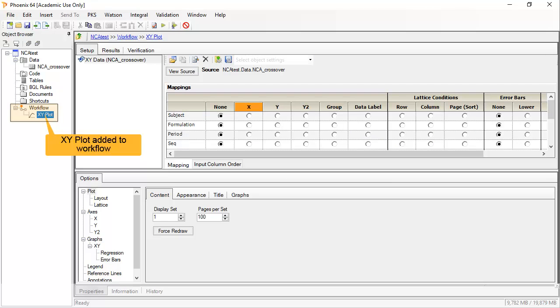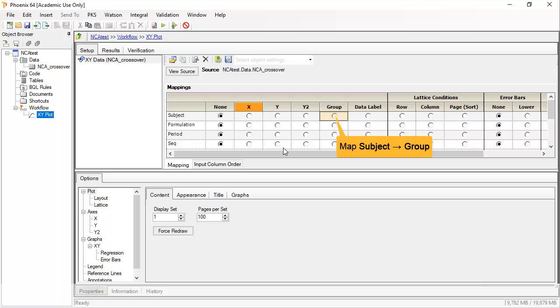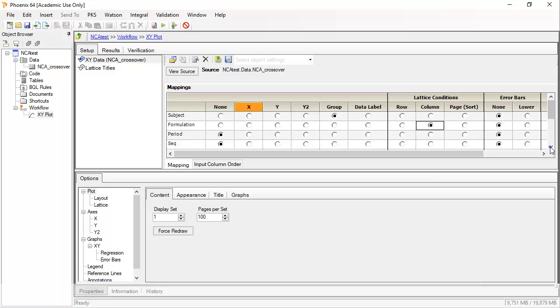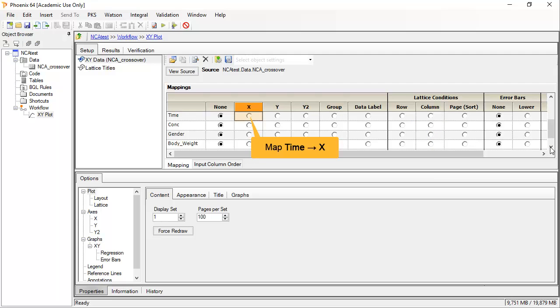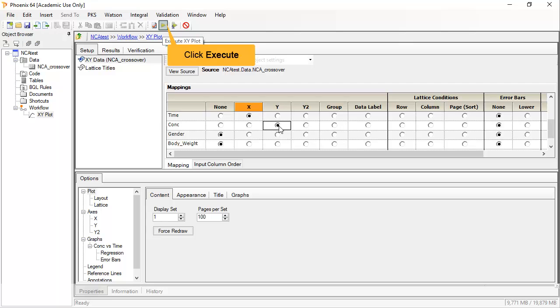This results in an XY Plot object being placed in the workflow, as well as linking the input dataset. Mapping Subject as Group makes it the profile identifier in the plot. Selecting Formulation as Column Lattice Condition will create additional plots by formulation on the same page. You can scroll down to see more columns. Select Time as the required variable X, and Conc as Y. Then, to create the plot, click on the green arrow to execute this object.